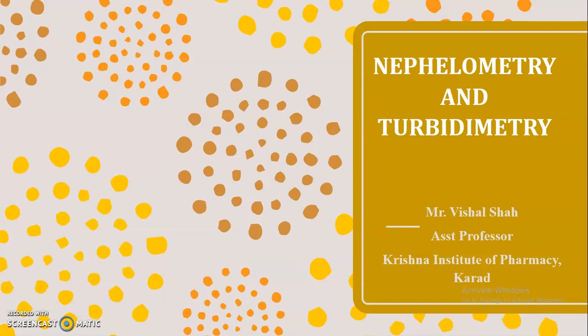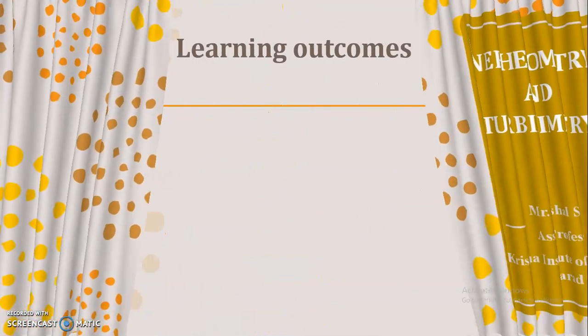Now let's begin with today's session, that is nephelometry and turbidimetry. In this video, we are going to discuss the introductory part as well as the difference between nephelometry and turbidimetry, then the instrumentation of the turbidimeter, as well as the different factors that affect nephelometry and turbidimetry.